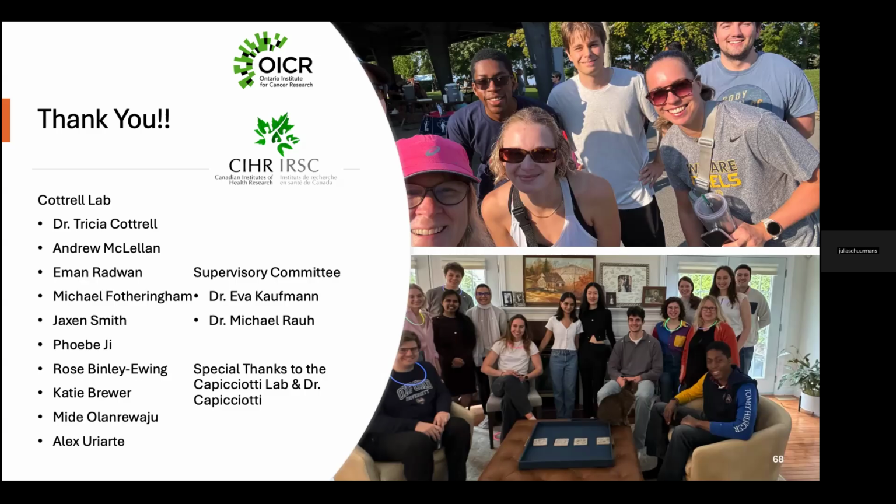I did have a question about, I guess, the logistics of the PanMembrane. When you were describing the three components of it, I was wondering, is there a difference between adding those together as opposed to having them stained separately? Is there a caveat to having them all in one sort of stain?